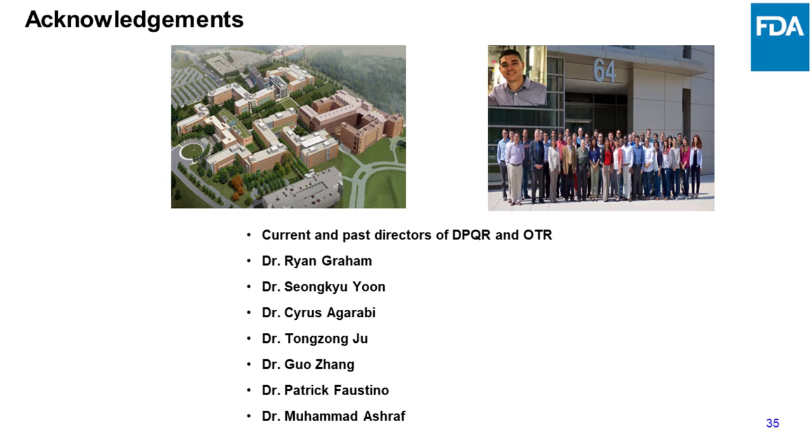Previous question? Yeah, I think we tend to compare this matrix effect somewhat more thoroughly, not only by comparing the metal content in the medium alone, but in the cell culture medium, cell-free medium, and also with different stages and different processes. All those variabilities we have taken into consideration. And the procedure we came up with appears to have the least interference in terms of the matrix that can be attributed to matrix.